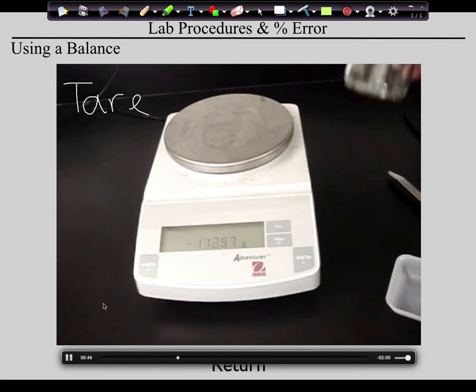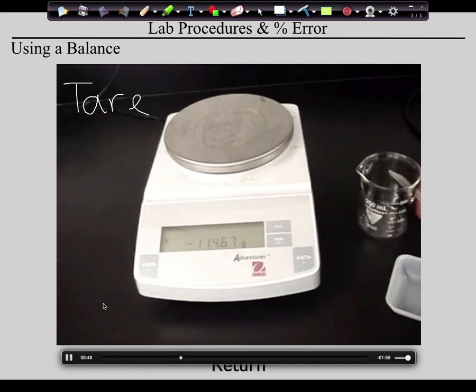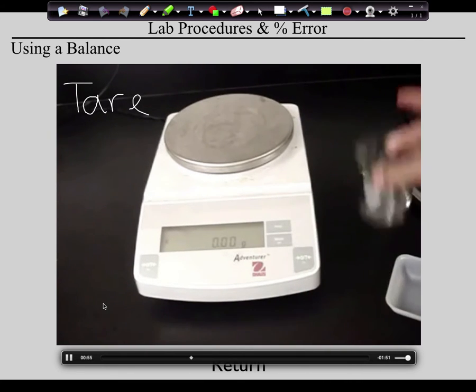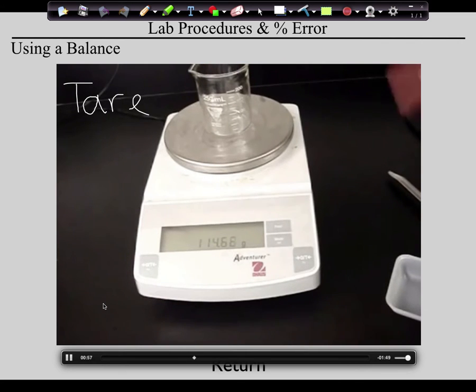Now, if I want to know the mass of the beaker, I want to make sure that it says zero before I put the beaker on. So I would hit tare. Now it says zero. Now I'll put the beaker on, and I'll have the mass of the beaker. If I then were to put an object in it, now I have the mass of the beaker and the substance that is in the beaker. So how do you then find the mass of the thing in the beaker? You subtract. Good.